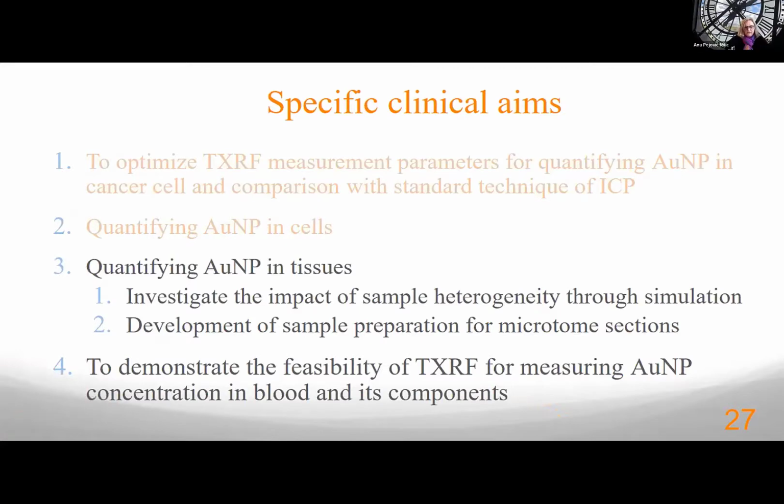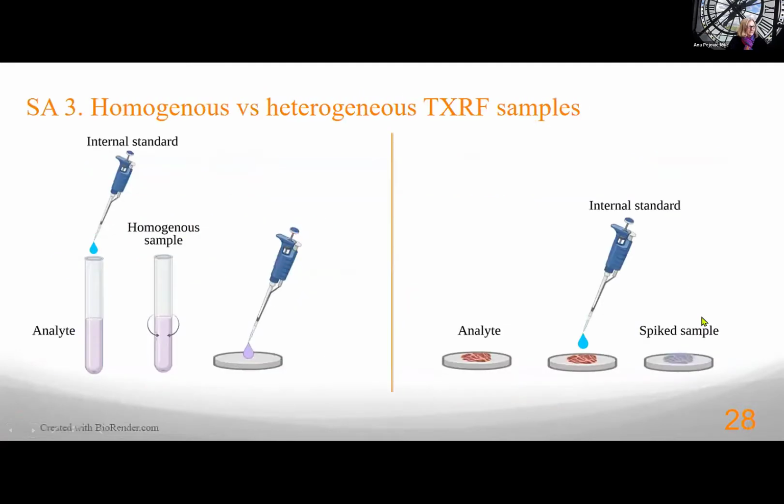So this is just one of the examples of multiple projects that are going on right now based on the ability of TXRF to quantify reliably gold nanoparticles. And the clinical translation requires us to basically look into, can we quantify gold nanoparticles inside tissues? And that will be the next set of slides I will talk about.